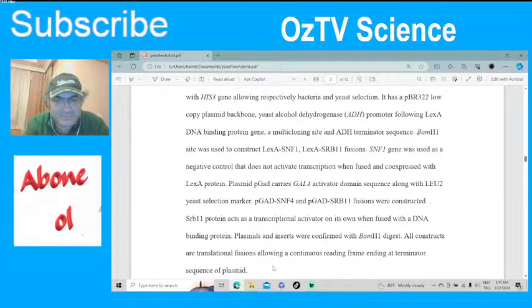So, a second plasmid carrying the other protein, another plasmid carrying the protein of the activation domain, along with the LEU2 yeast selection marker, because you cannot insert the plasmid without the marker. Otherwise, it won't keep the plasmid. It'll wash out. To be able to keep the plasmid, the plasmid should make the cell prototroph. Otherwise, it's no good.